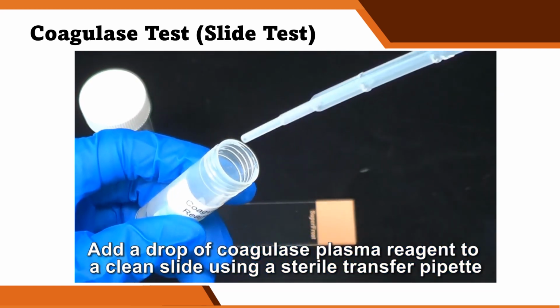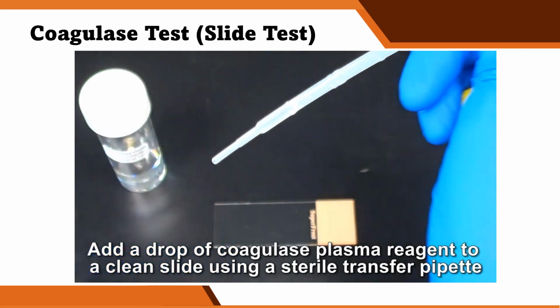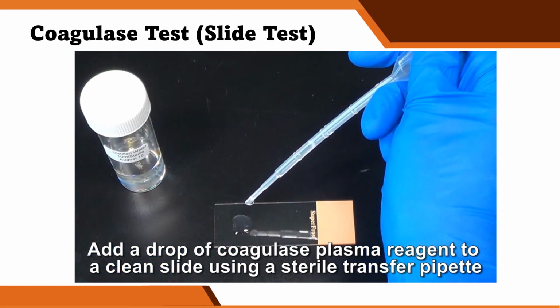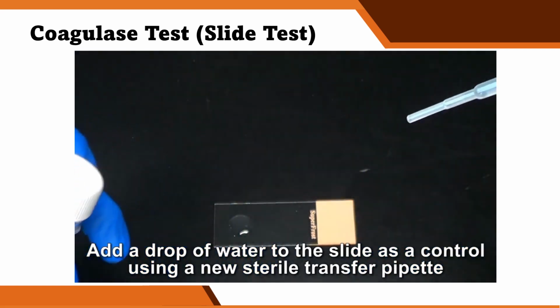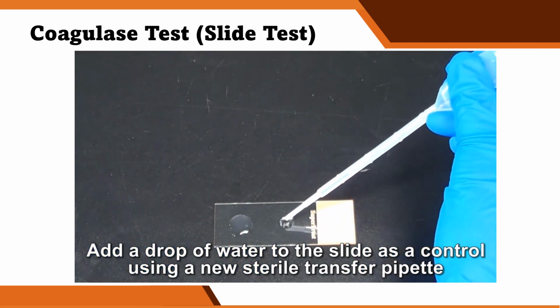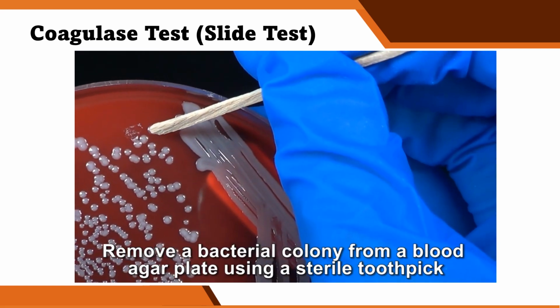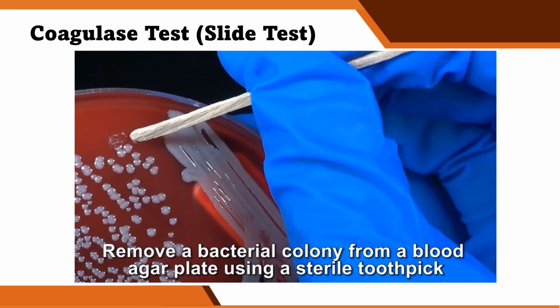Using a transfer pipette, add a drop of coagulase plasma reagent to a clean slide. Then add a drop of water to use as a control. Using a sterile toothpick, remove an isolated colony from a blood agar plate.